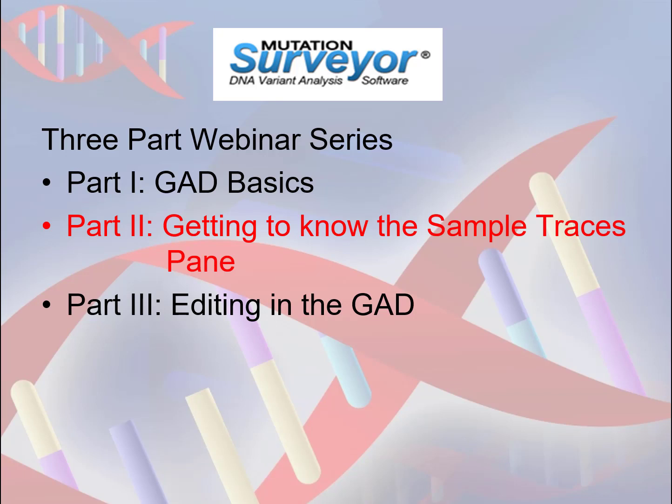Last time, we reviewed the basics of the different panes in the GAD. Today, in Part 2, we will become more familiar with the details of the Sample Traces pane. Please make sure you are already familiar with the basic layout and description of the GAD by watching Part 1 of this webinar series, or the introductory overview webinar.